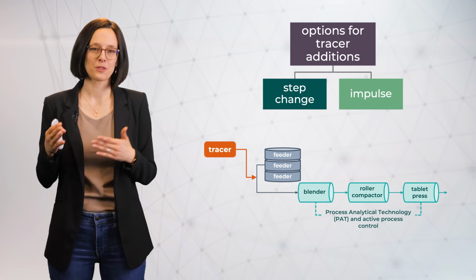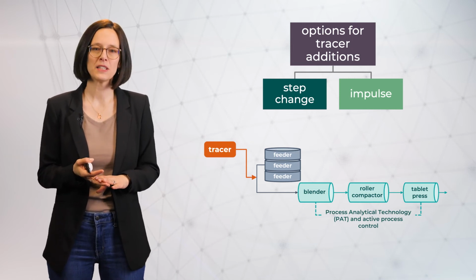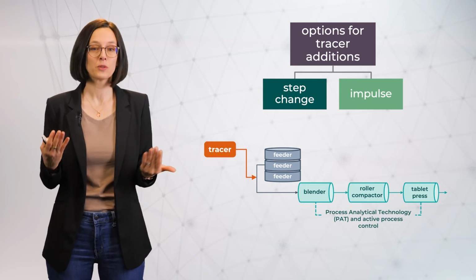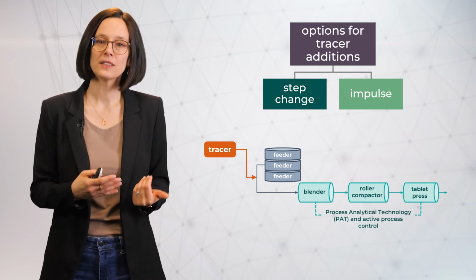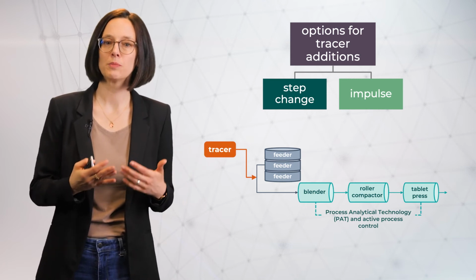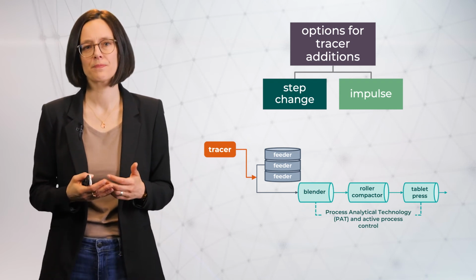Depending on the detection method, different tracers are used. Sometimes it may be the easiest to use a color. This means that you use existing material from your formulation that has been dyed with a different color, or you add a different material with a different color. You would then evaluate the response function with a camera, or you could also analyze samples offline. This offline process can be conducted either by taking pictures or with an analytical method. UV-Vis is very useful in this case.